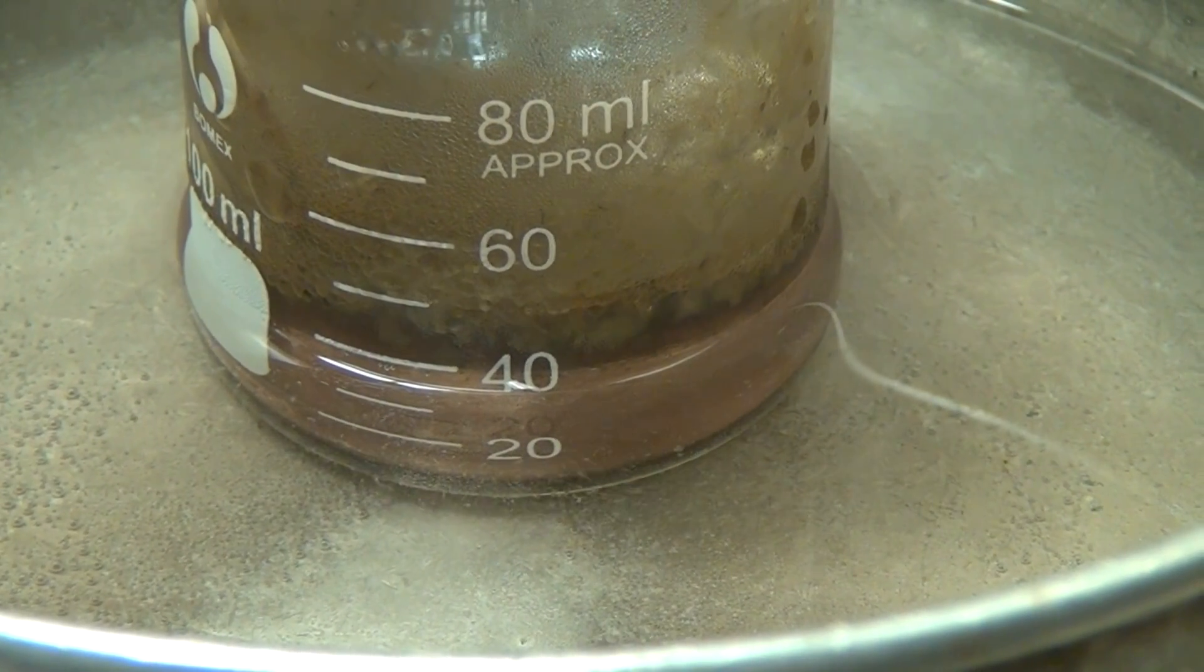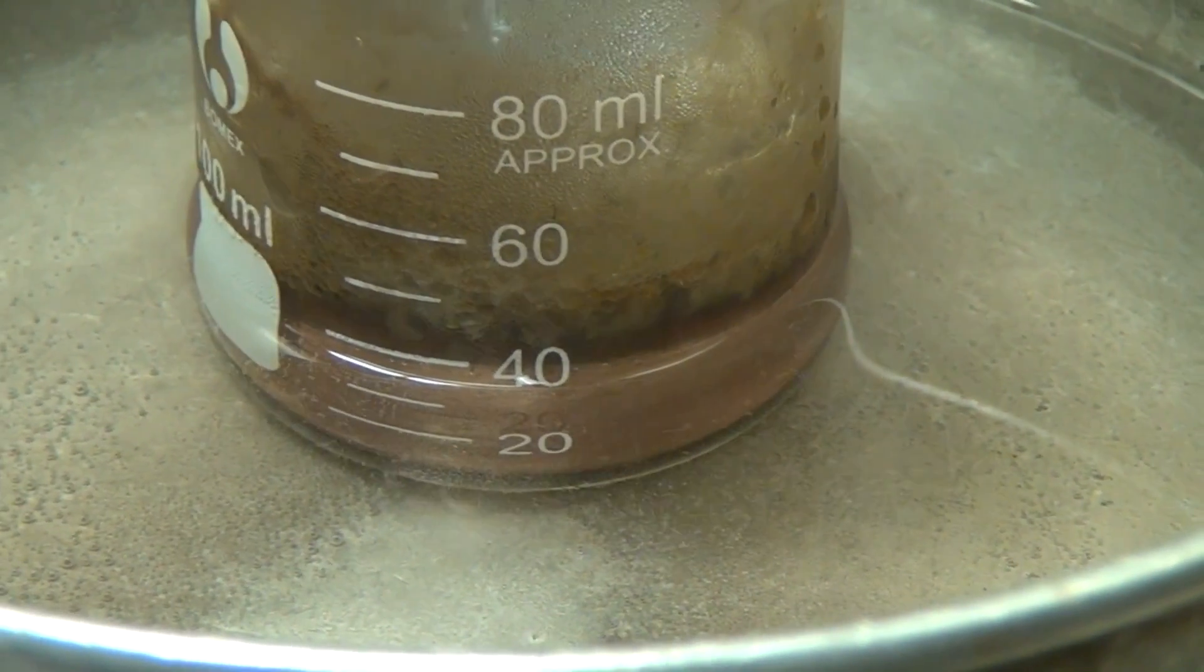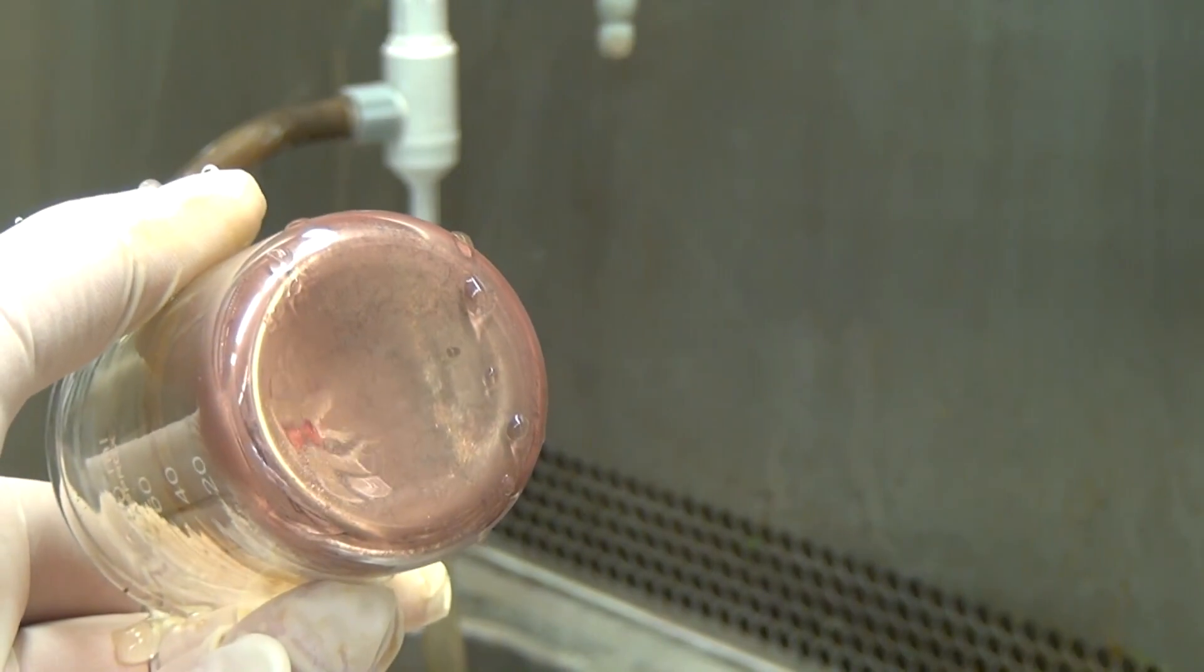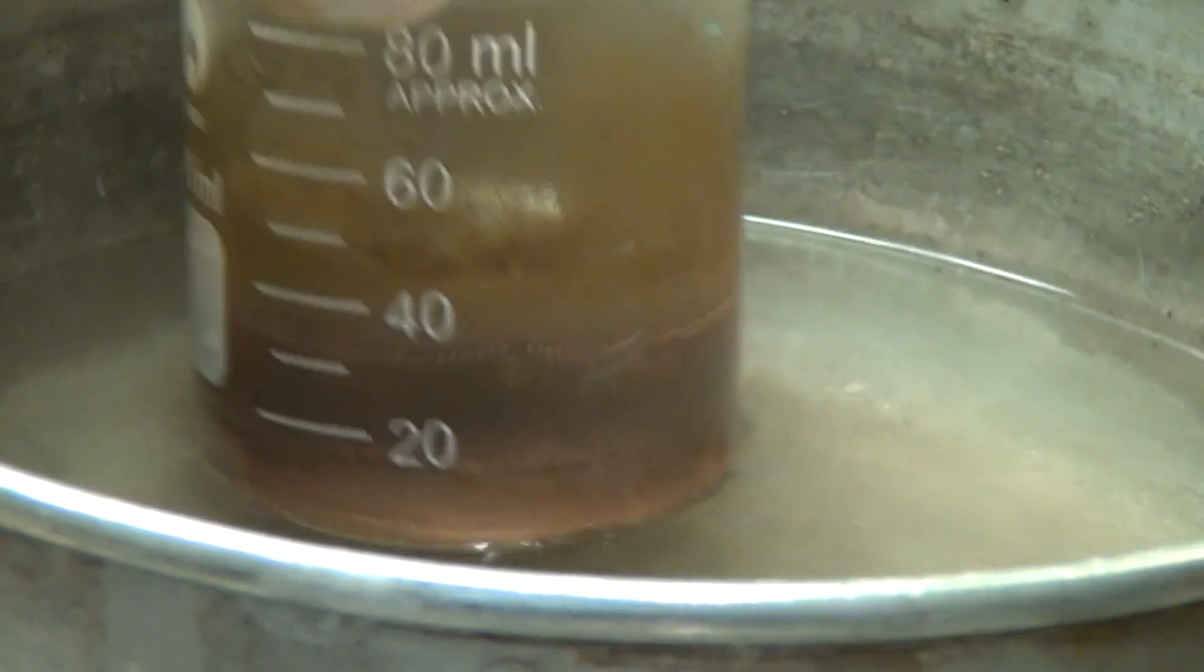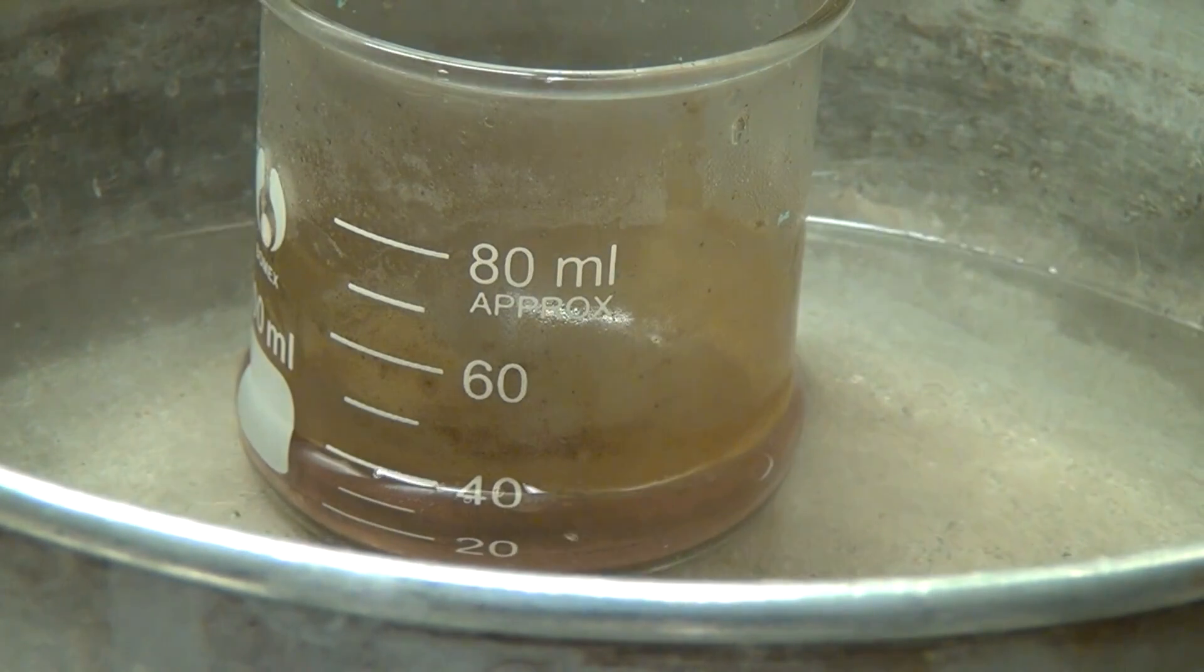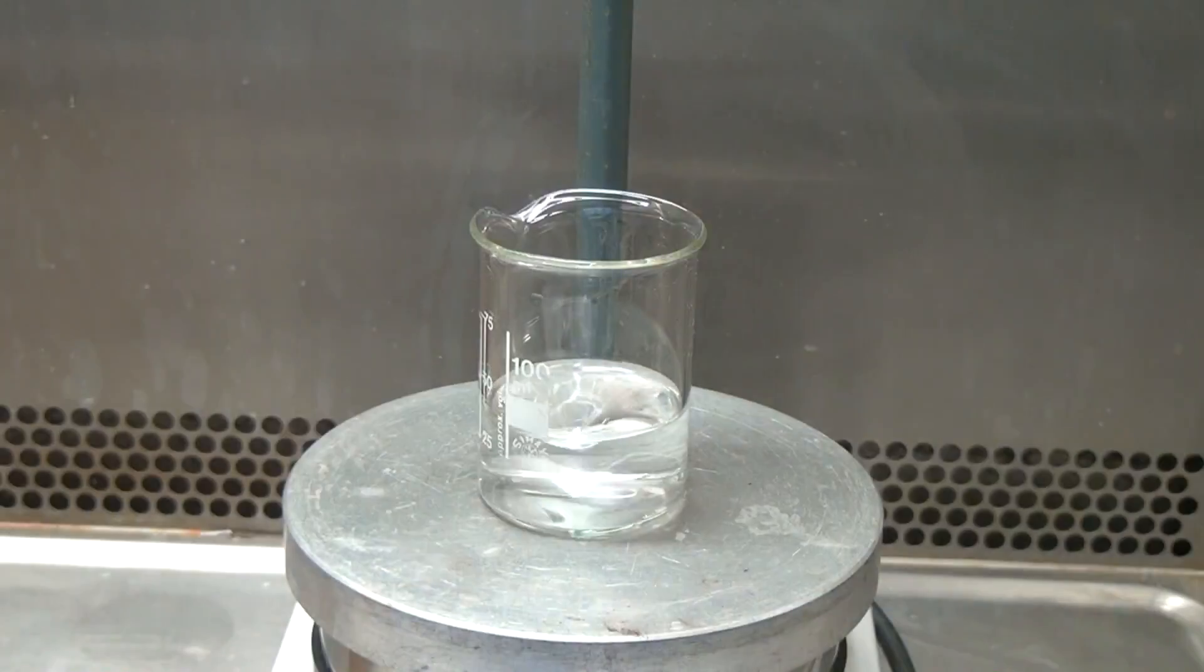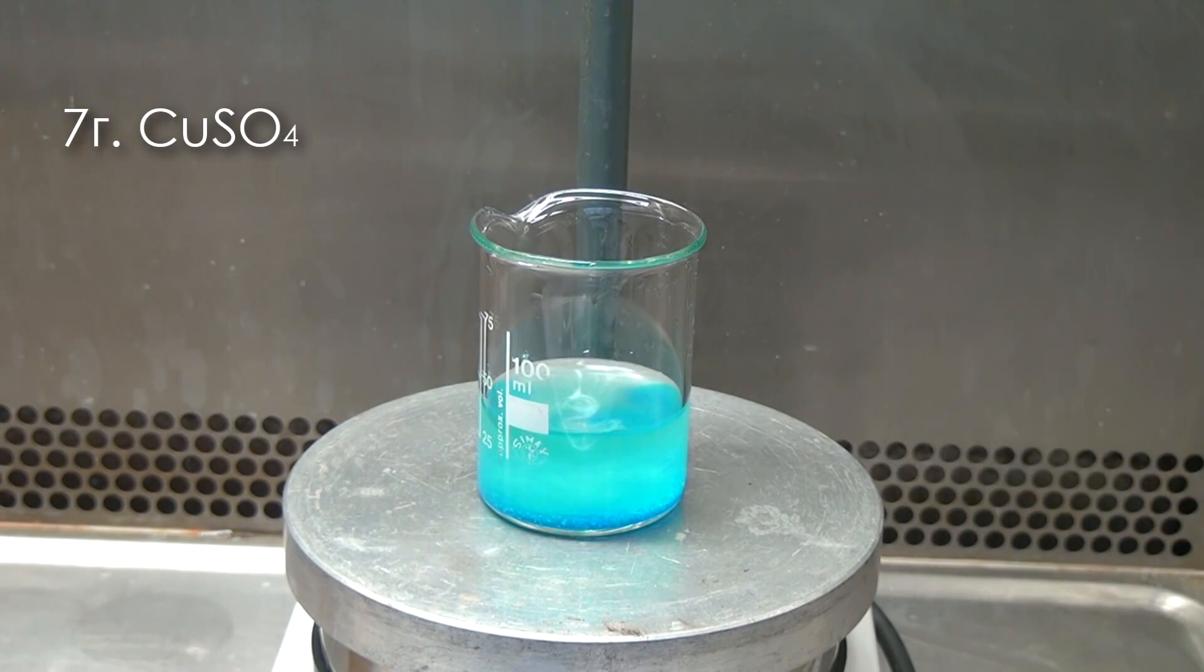Hello everyone. Today we will conduct an interesting experiment called obtaining copper or copper mirror reaction. This reaction is the reduction of copper to the metallic state and depositing on the surface of a glass beaker. First, we take a glass and pour about 50 milliliters of water. Next, we dissolve 7 grams of copper sulfate in the water.